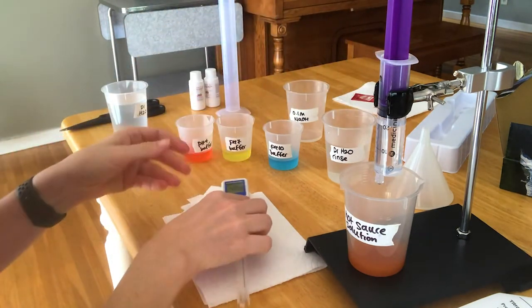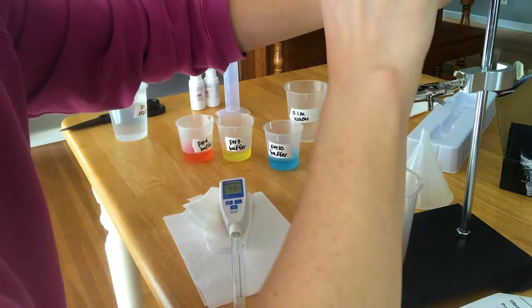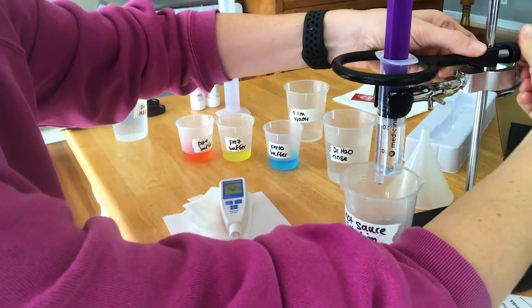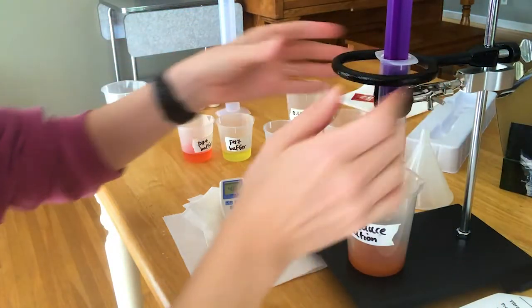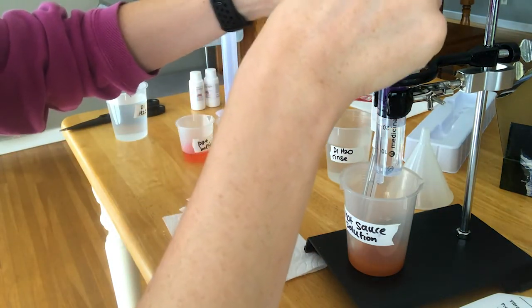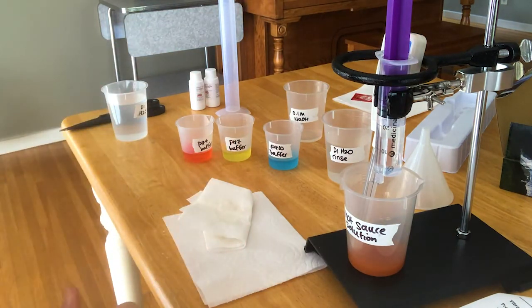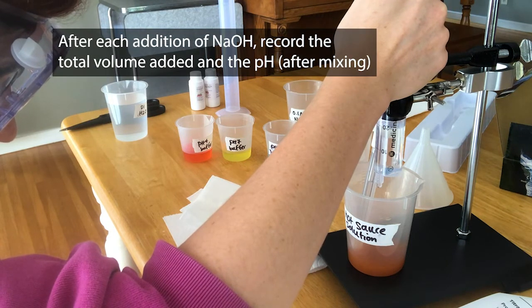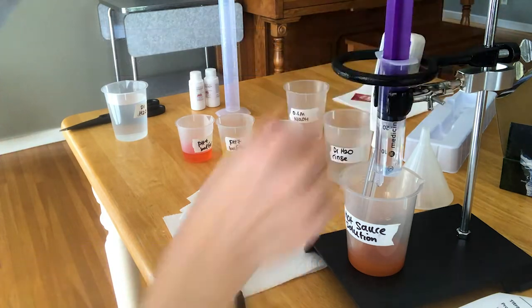This pH meter has to go in the hot sauce and I don't want to hold it the whole time, so I found this other clamp that came with the ring stand — this is kind of an off-market use of it, but I'm clamping it here so I can prop up my pH meter. What you're going to do is add small additions of base, definitely not more than a milliliter at a time. Write down the total volume of sodium hydroxide that you've added at each point. After you add it, make sure there's not a drop hanging down — if you see one, you can tap it.